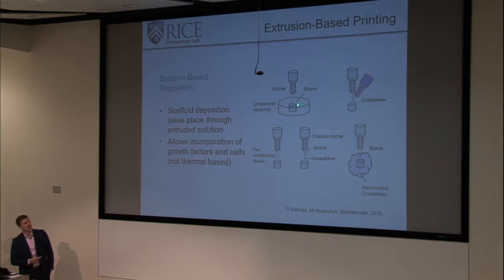As soon as that alginate hits the calcium chloride, it starts to cross-link. So unless you have a really good way to make sure that you're printing the alginate onto the bottom of the dish, and that it's actually sticking to the bottom of the dish, you're just going to end up with this floating mass of alginate.